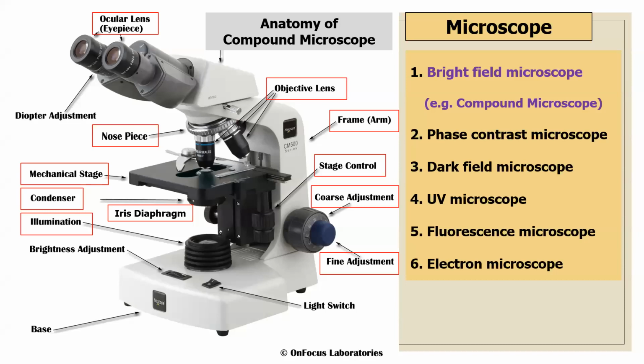Let's move on to the first practical: the microscope. In a microbiology laboratory, microscopy is needed to help study the shape and structure of bacteria, fungi, and other microorganisms. A microscope which is commonly used in microbiology labs is the bright field microscope. It is a compound microscope which consists of 2 or more lenses. Components of the bright field microscope are shown in the figure.